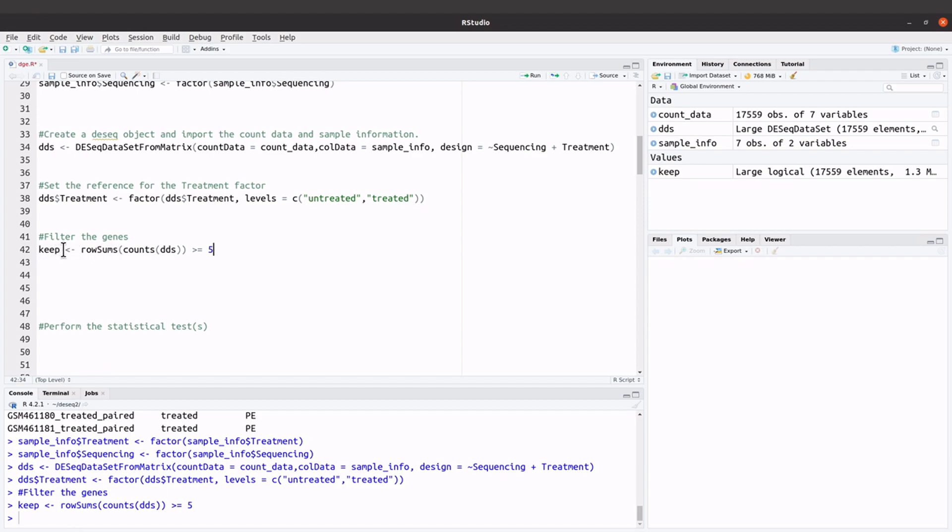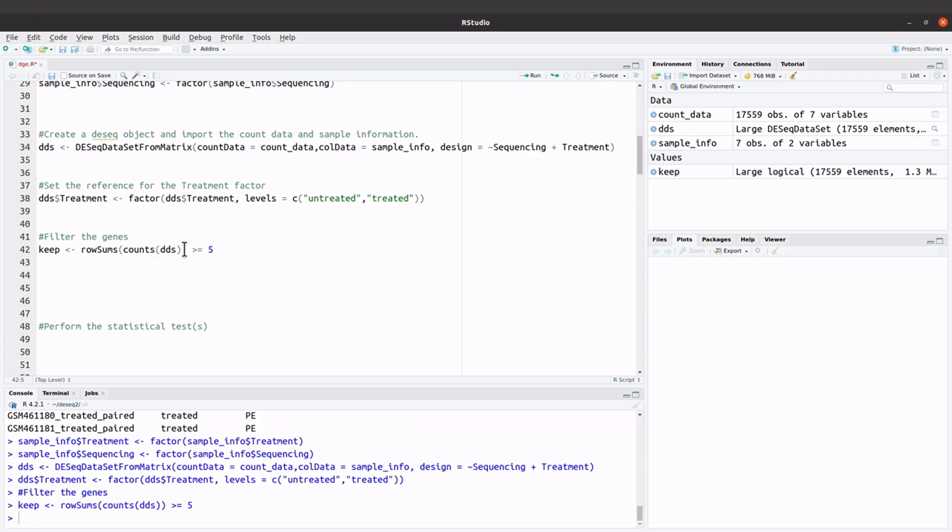So what we've done is that we've given this expression so that means that genes with read counts greater equals to 5 will be kept here. The keep here is going to keep that record. This variable will keep that record, so all genes which counts greater equals to 5 will be here, and then we'll issue this command.